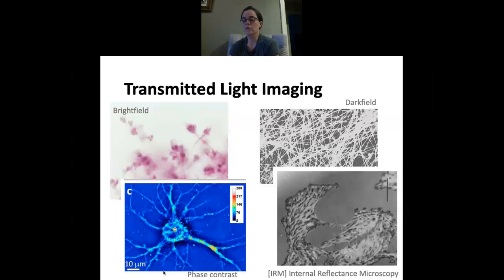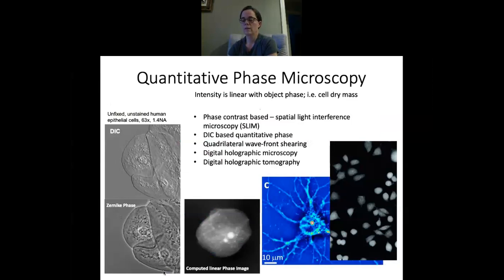The development of transmitted light microscopy methods that are quantitative are often referred together in one category called quantitative phase microscopy. And that development has created a variety of systems that provide submicron resolved 3D volumes of refractive index and material density information. So transmitted light methods can now quantify optical properties of the sample as well as provide qualitative contrast.